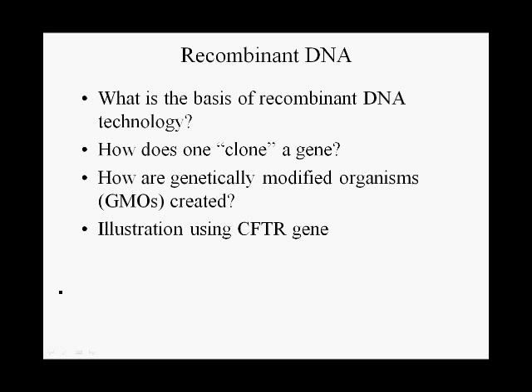This video covers the fundamentals of recombinant DNA technology. In a way, you can think of this as Genetic Engineering 101. After this video, you should understand the basis of recombinant DNA technology, what it means and how one may clone a gene, how we can create genetically modified organisms, and I'll try to illustrate the applications of these techniques using the cystic fibrosis transmembrane regulator gene, a gene that we have talked about in previous videos.